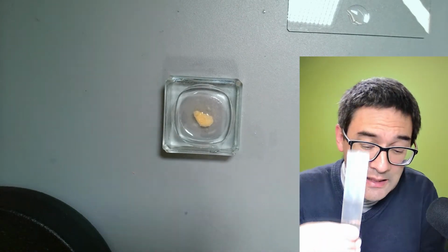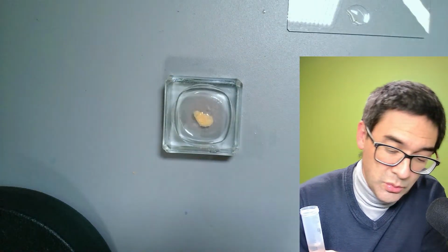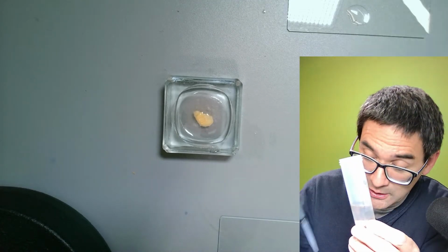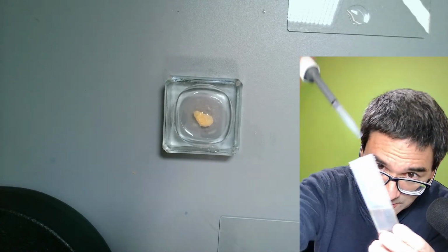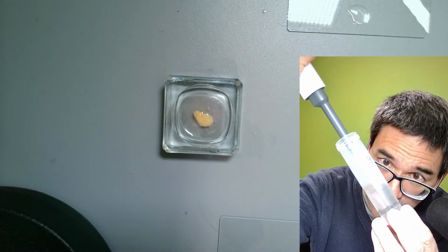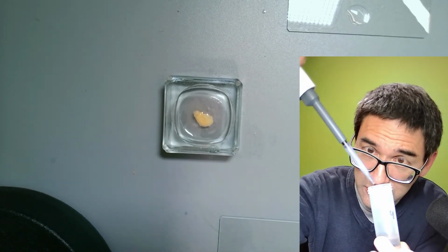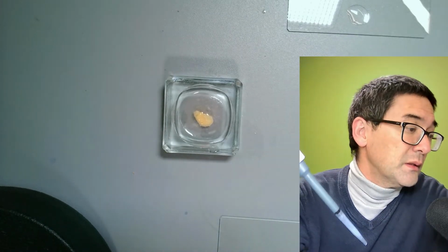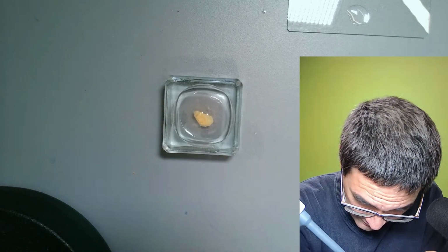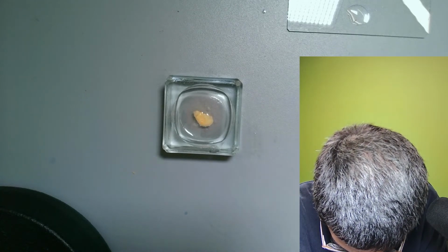It contains many Aeolosoma. Aeolosoma are those cute little worms, the so-called oil droplet worms, and there are, for whatever reason, many of them in here. So this shouldn't be a problem, to pick out one of them. They like to be on the side of the... Up here we go. Actually, I think I got two. Okay. And let's see. One. Two.